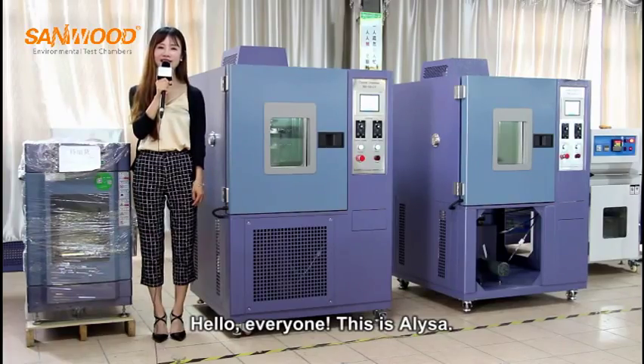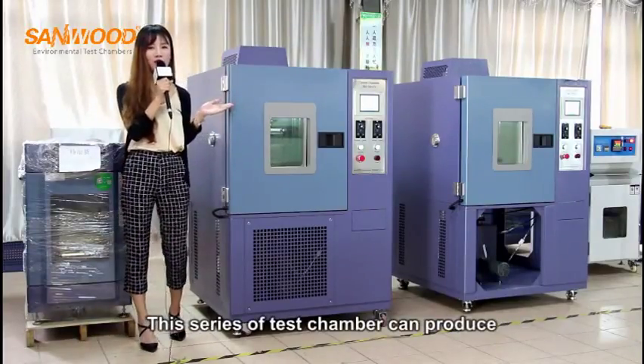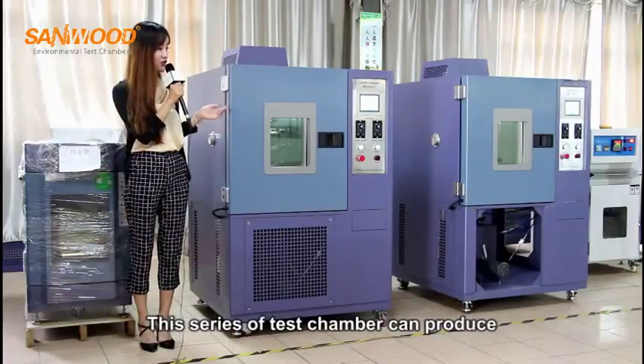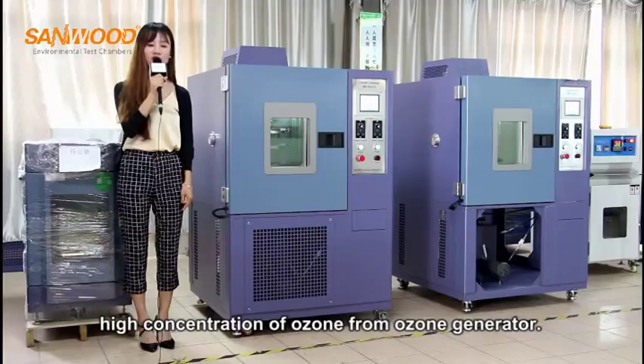Hello everyone, this is Alisa. Today I will simply introduce the ozone chamber. This series of test chambers can produce high concentrations of ozone from an ozone generator.